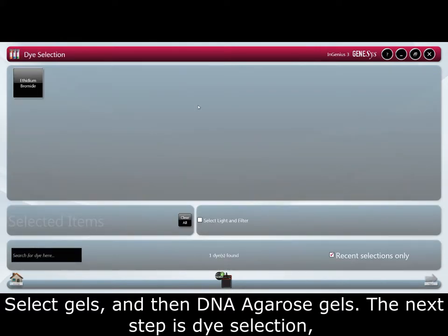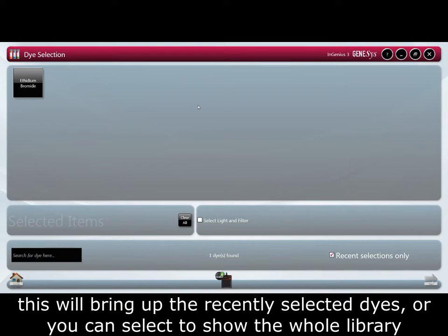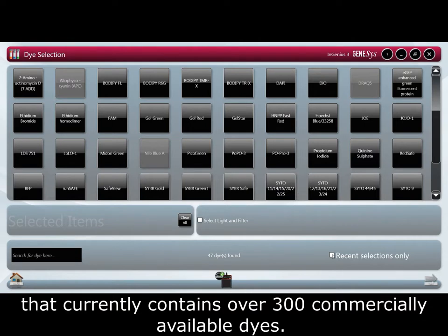The next step is dye selection. This will bring up the recently selected dyes, or you can select to show the whole library that currently contains over 300 commercially available dyes.